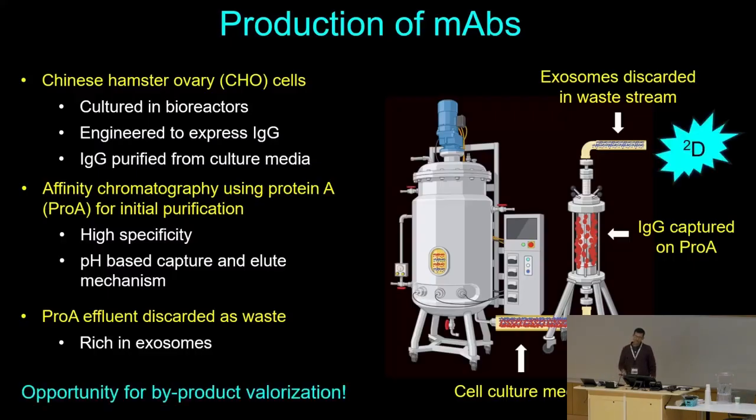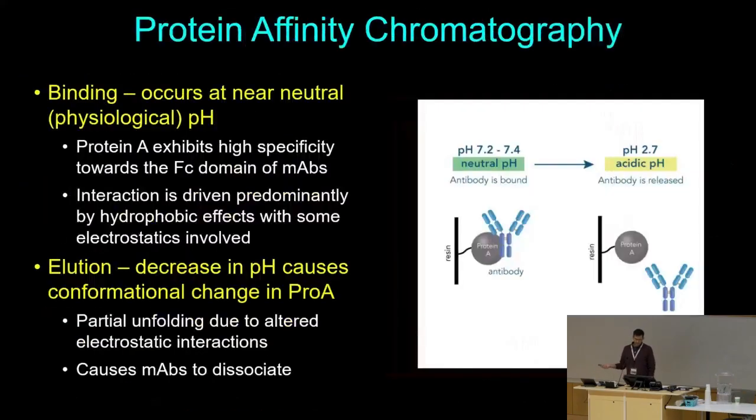And so this presents an opportunity for byproduct valorization, and also at the very least, online exosome quantitation, even a semi-quantitative one, could provide an additional metric for process analytical technology when monitoring cell culture health, considering that exosome production is upregulated in direct response to cellular stress. And additionally, offline analysis of exosome cargo might be correlated with process health states and prove even more informative.